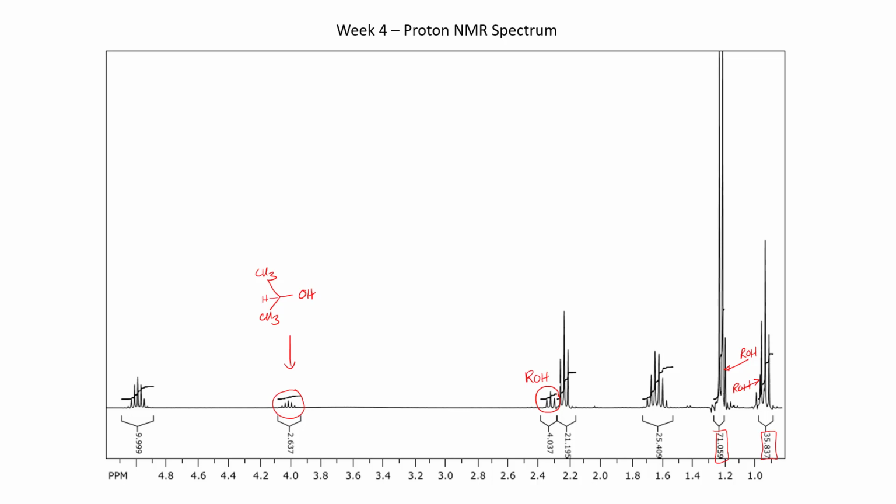Now what I'd like to do is, okay, I know there's unreacted alcohol in here. What is my percent purity of this ester?